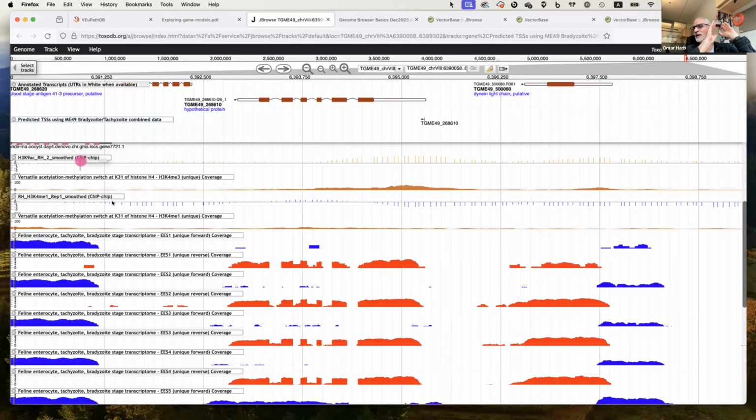I'm not going to go through the details of the technique, but the bottom line is you immunoprecipitate your DNA bound to, in this case, a modified histone. There are different antibodies to different modified histones, and then you detect where those modified histones were binding. Depending on the modified histone, it may bind to different parts of your chromatin. You can mark open chromatin, closed chromatin, transcriptional units, or, depending on your organism of interest, regions where the hypervariable genes are located. There are all sorts of modified histones that mark your genome in different ways. They will be your epigenome and give you this whole other layer of regulation and access to your genes.